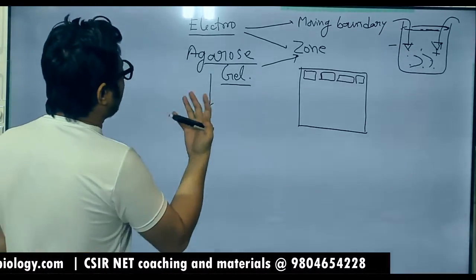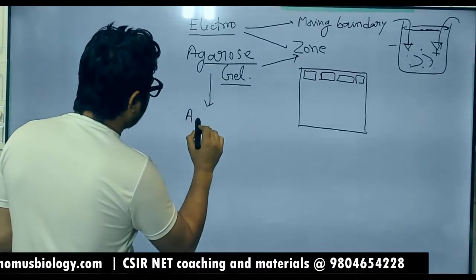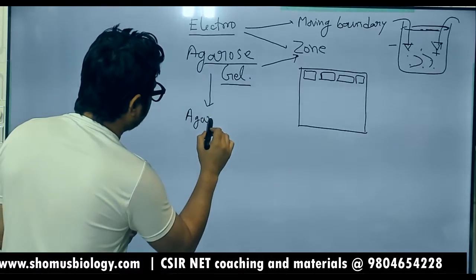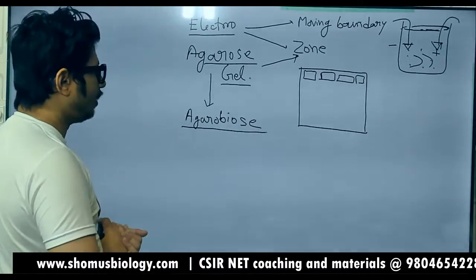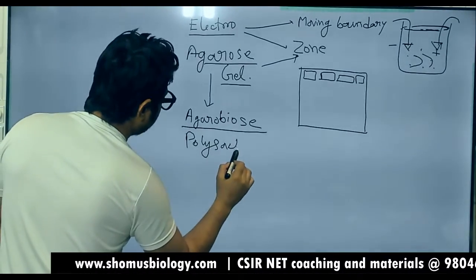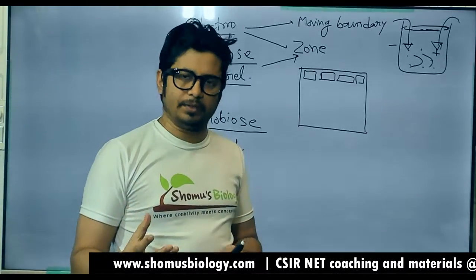Okay, and agarose is basically a polysaccharide. That means basically a sugar molecule.